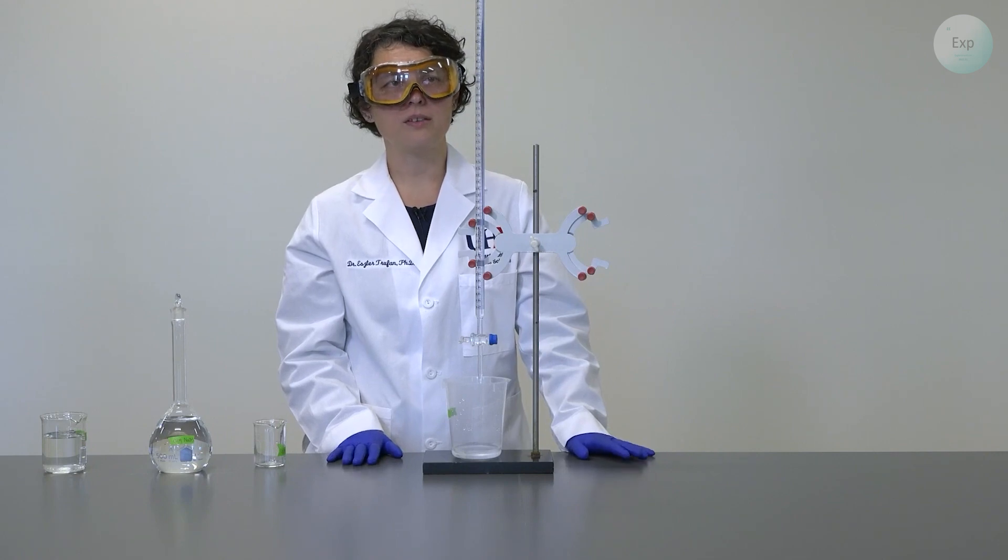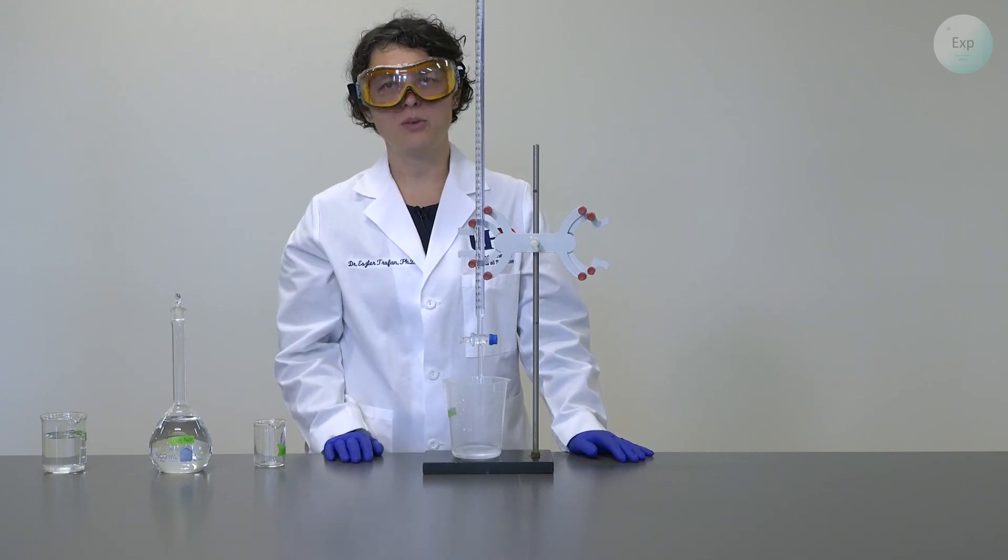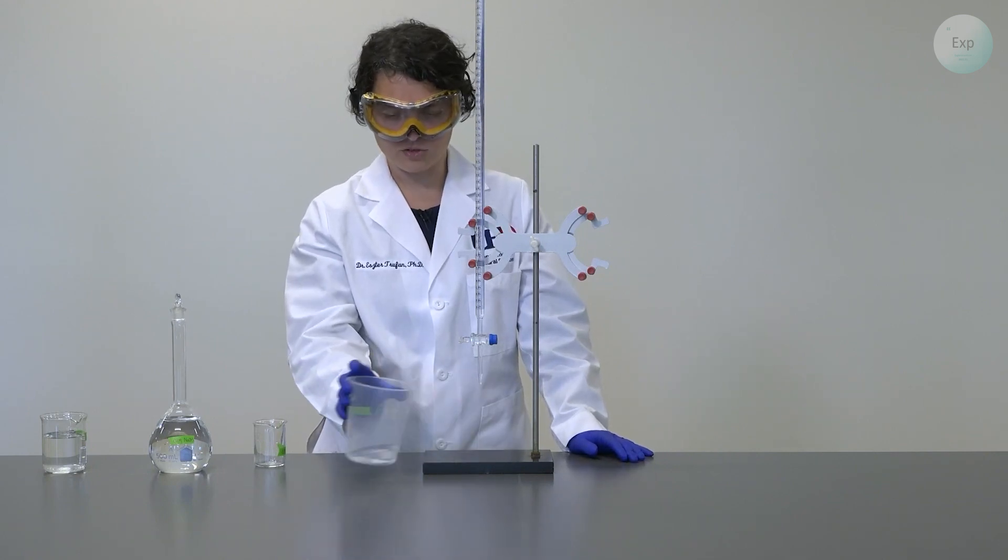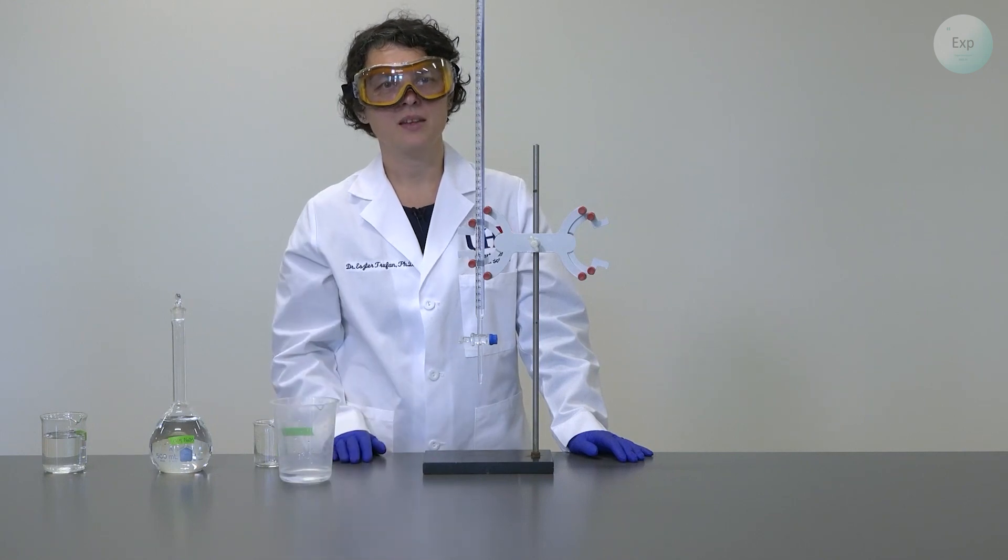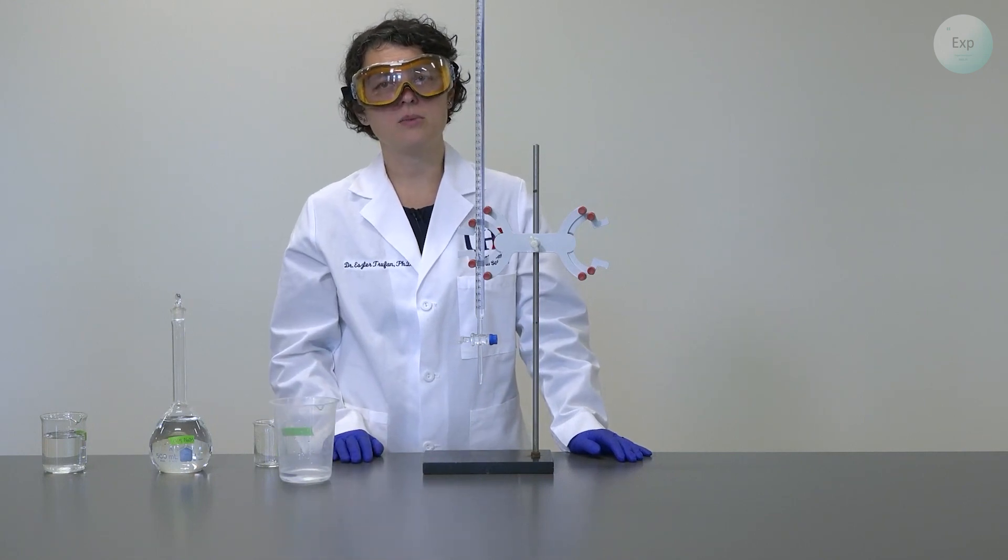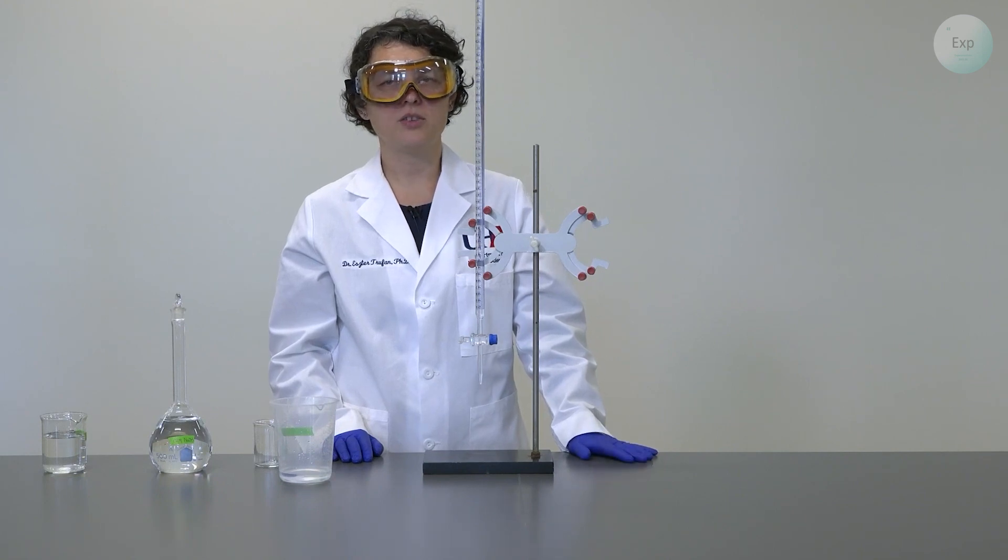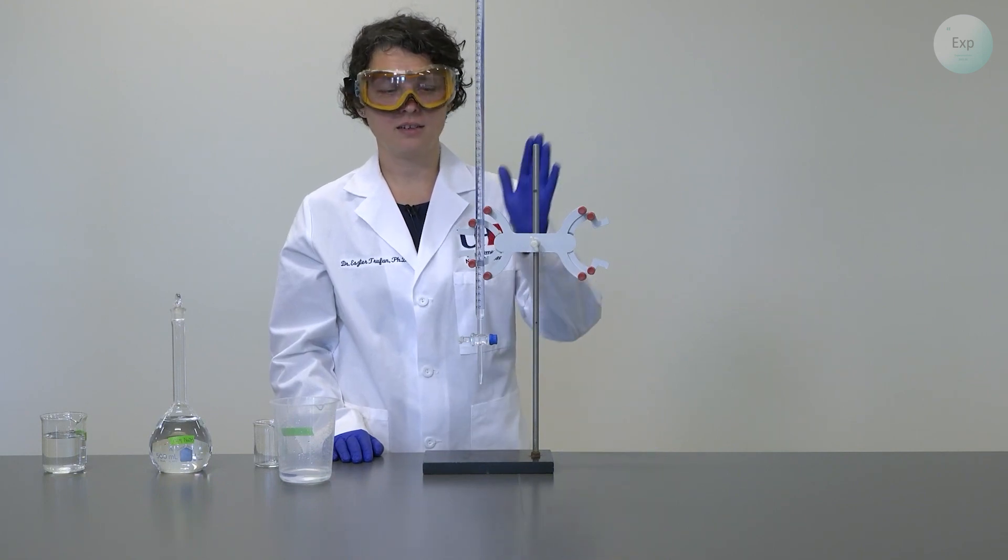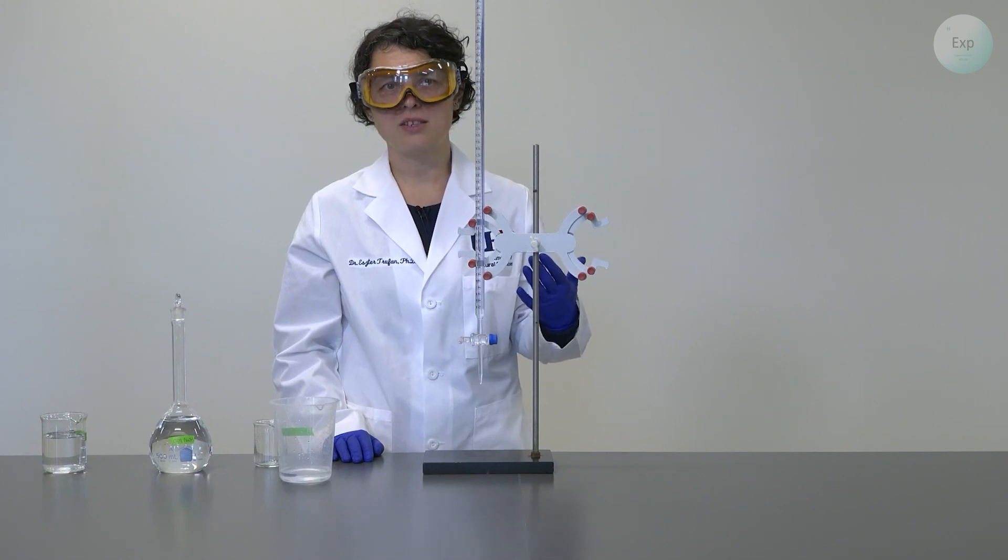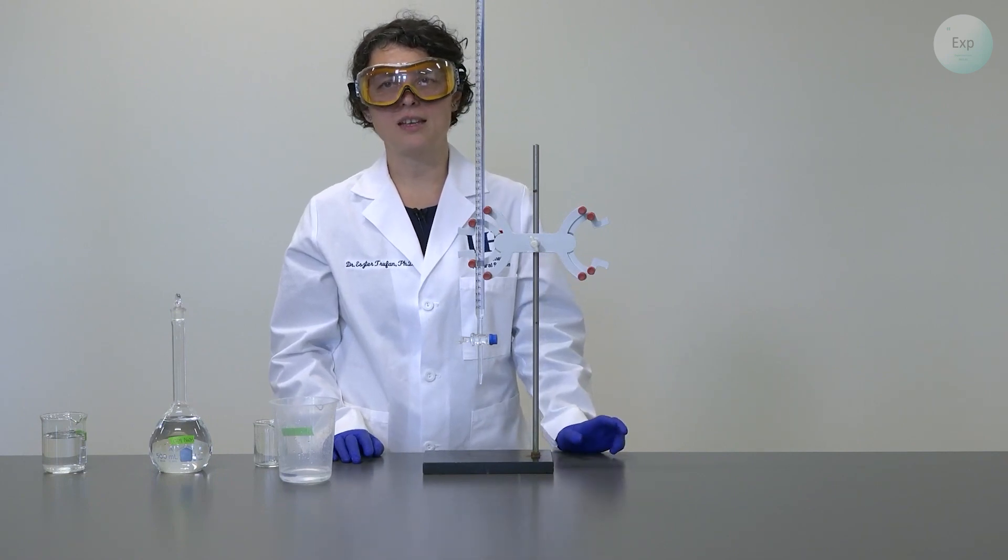At that point, our top volume on the burette should be below the zero mark. And now when we are ready to begin our titration, we need to record the volume of the solution that is inside the burette. Now, mind you, this is not an exact volume. We will call it a starting volume.